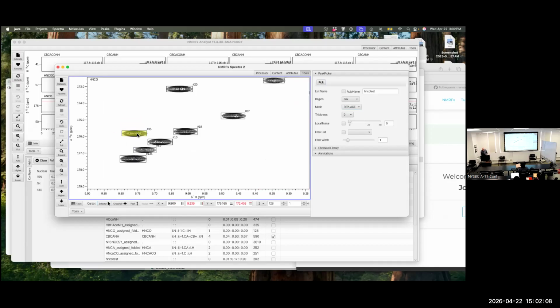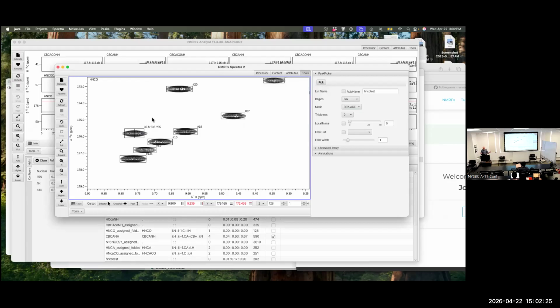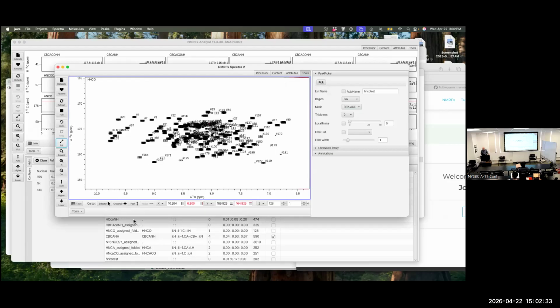That's peak picking. In the selector mode, we can zoom around, we can click on peaks, we can drag them around, we can hold down the option key and resize them. On any peak, I can call up this inspector and manually assign things, so I can assign 32H from set. So that's peak picking. In the pick mode, you can also just literally drag across and let go, and it'll pick whatever's in that region, in 1D or 2D. Okay.